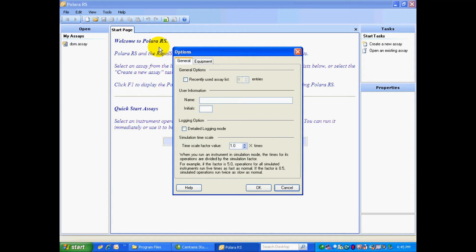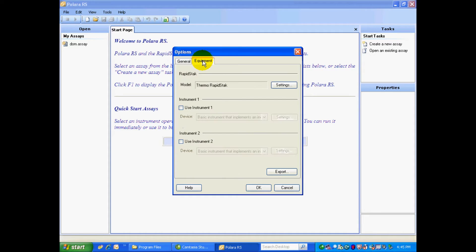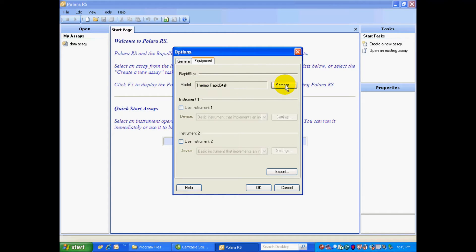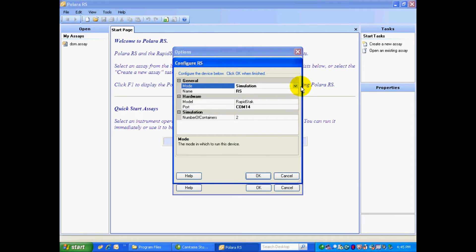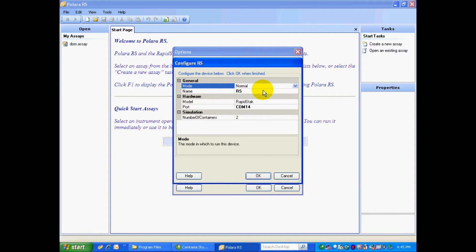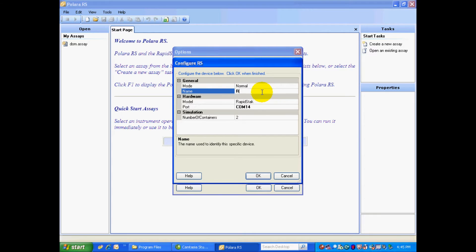Then our Options page comes up. We're going to select the Equipment tab and we're going to set up our system. Here's the Rapid Stack. I'm going to check on the settings. So we need to change the mode from Simulation to Normal mode, as I'm actually connected to a Rapid Stack and a Multiscan Go.